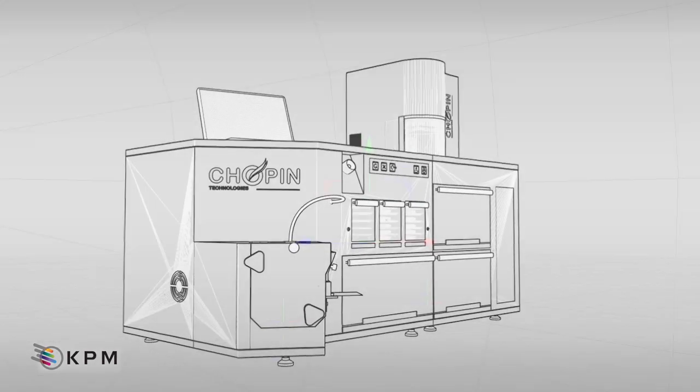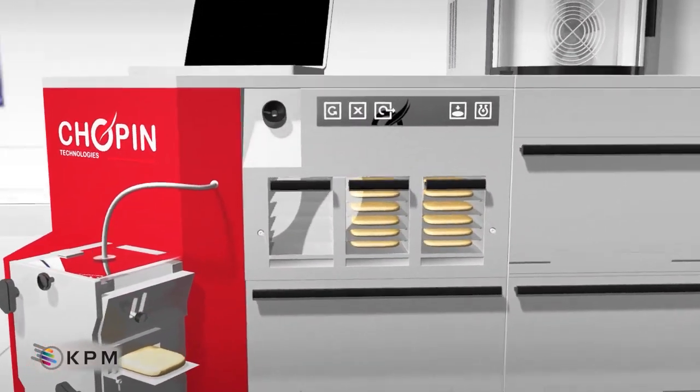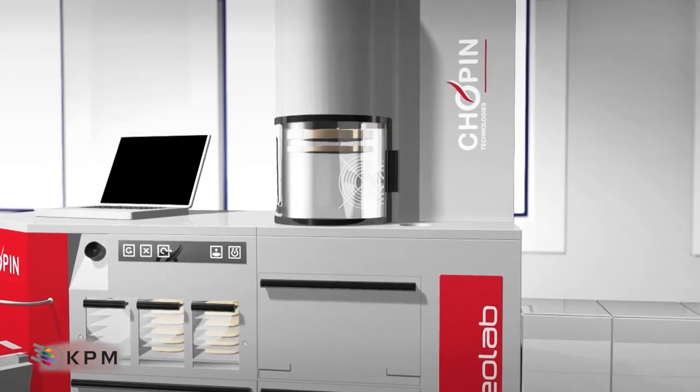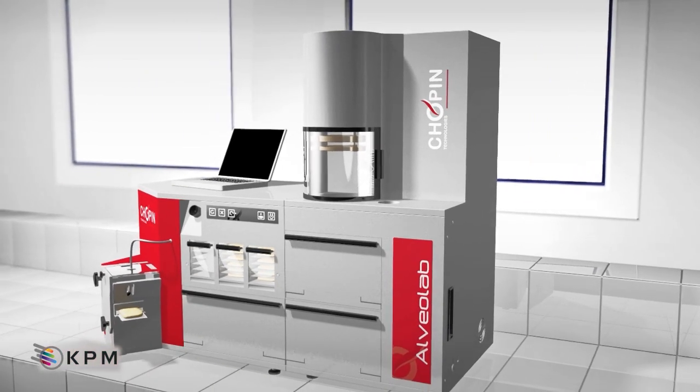The Alveolab represents the fruit of over 80 years of experience and today benefits from a number of highly significant innovations that make tests easier to carry out and more precise.